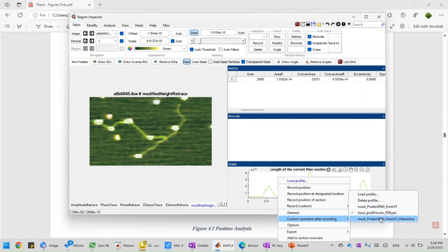This is not an exact measurement like what I just showed you using the crossover. It's just using the location of the peak and giving it a little bit of error, like plus or minus 5%, to determine whether it's a specific complex or not. So I have not done the more complex calculation here.